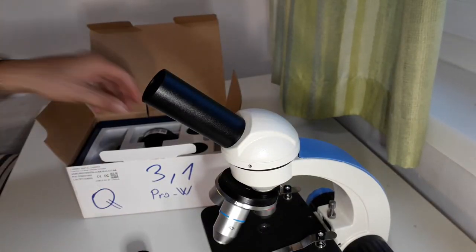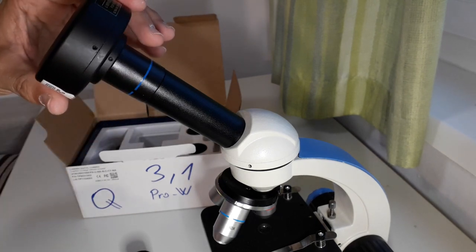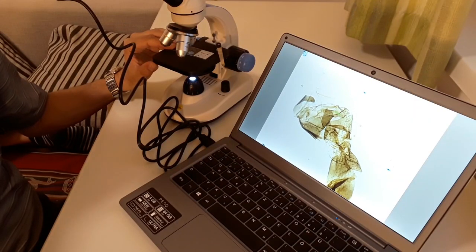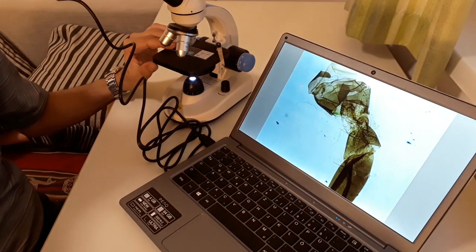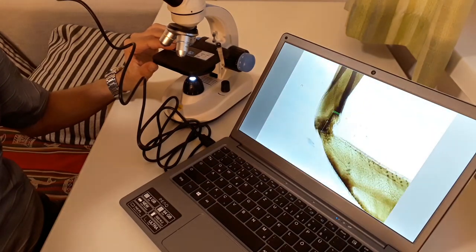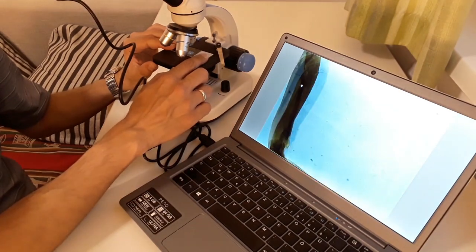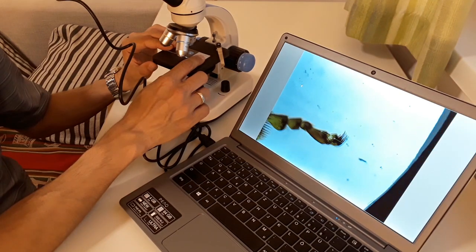Yes, another thing, not supplied, but I had it at home, is a digital USB camera. And I'm now just going to show you what's also possible. I have now connected the microscope to my laptop computer using this USB camera, so I can actually do on-screen microscopy this way. Those USB cameras are not so expensive, and they can give you a live view. And that is also quite convenient, and you can also take pictures this way, of course.